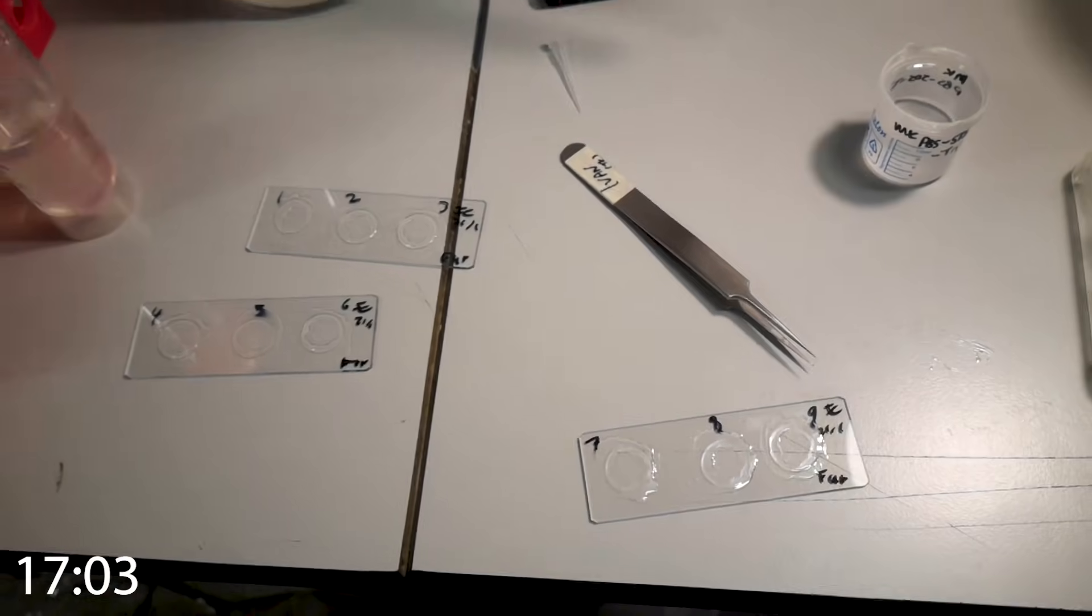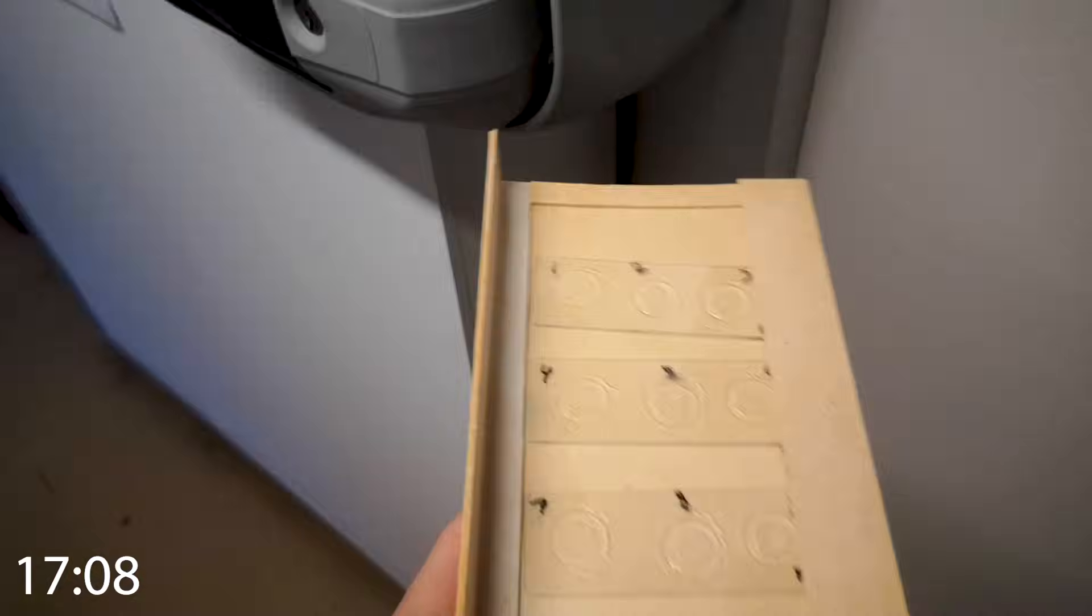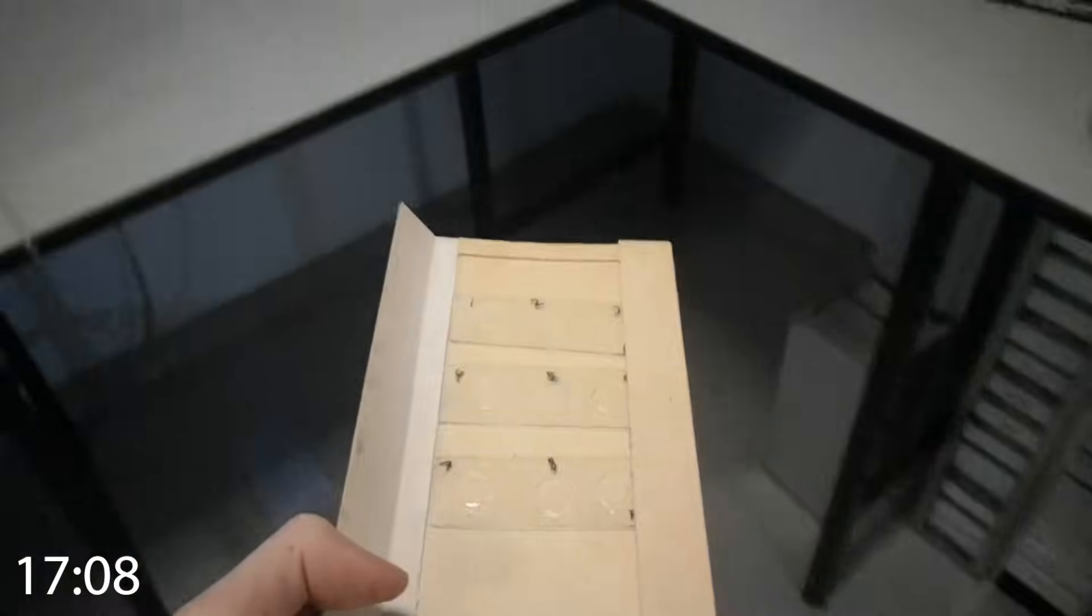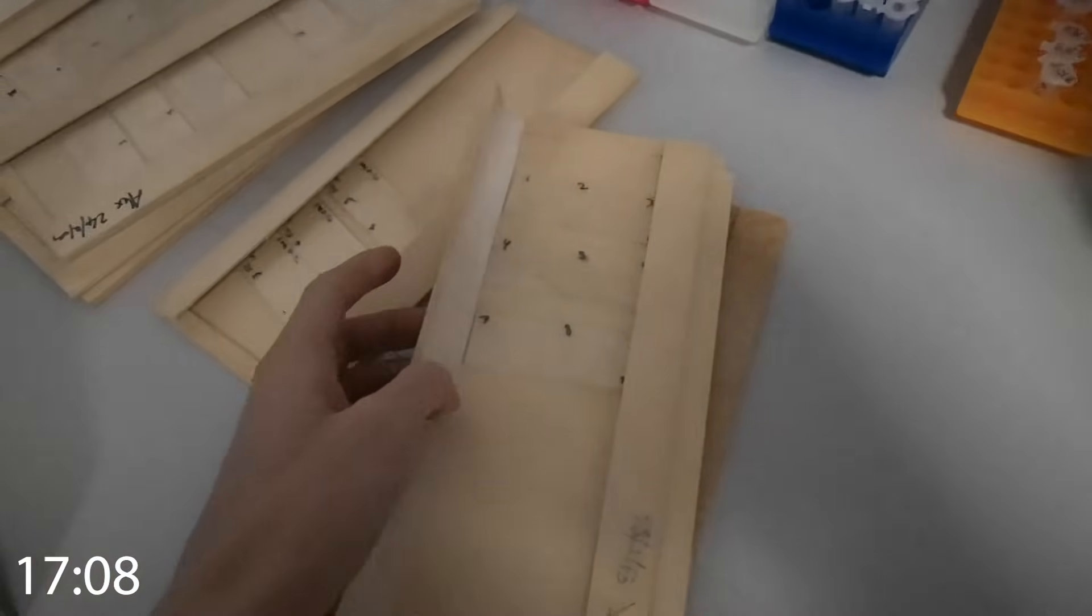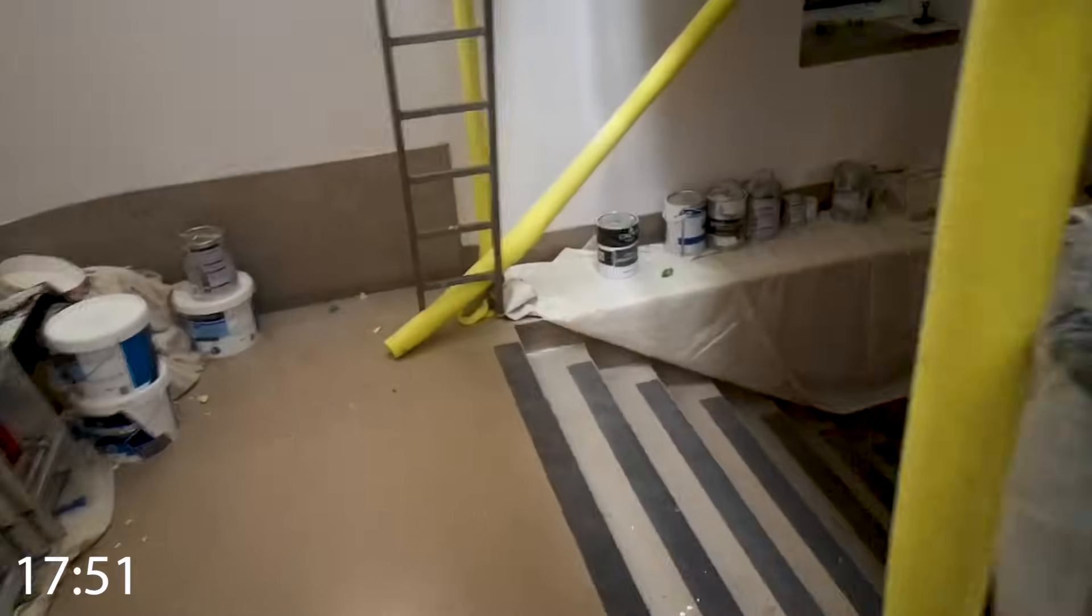5pm and we're done, now just time to clean up. I've now finished preparing my samples and put them into the cold room, which is like a fridge, but it's a whole room. So after spending all day on these, I'm now putting them in the cold room, and I'm going to image them tomorrow. I can now leave the prison, and I head home. It's just before 6pm, going home.